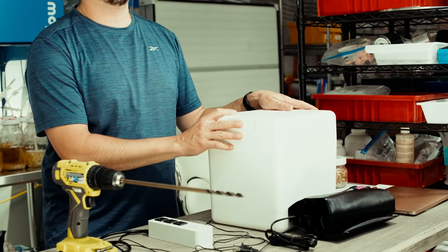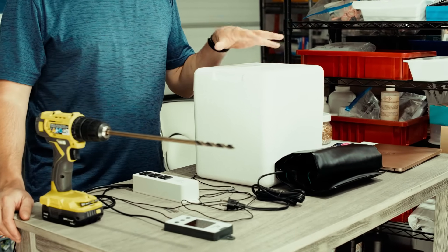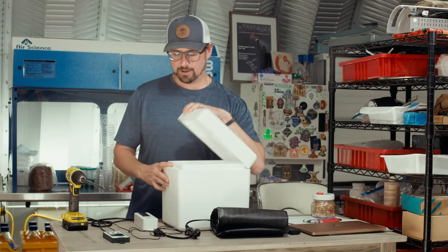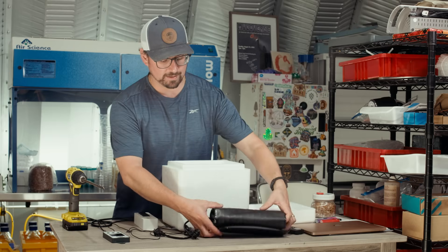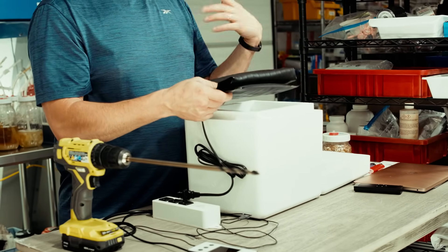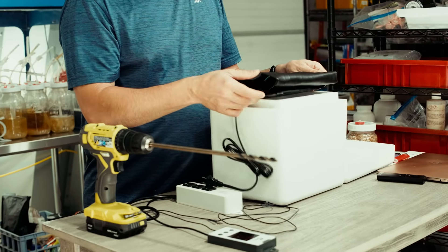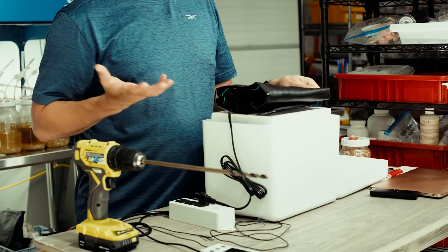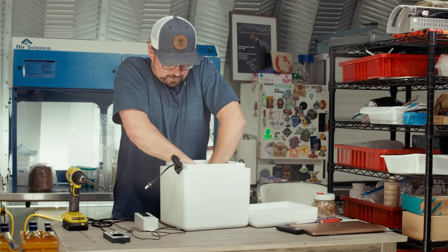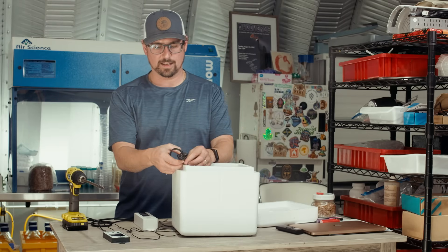This is a Duratherm foam cooler — it would work really efficiently even in the middle of winter. The steps to make this DIY are super simple. The first step is just putting the pad in the bottom of the cooler. You can also lay some insulation over the top so your cultures don't have direct contact, or just be aware to flip your plates upside down so the agar doesn't dry out from touching the pad.